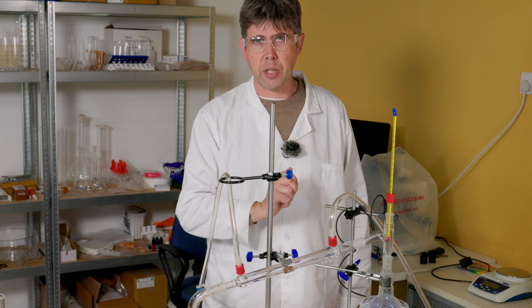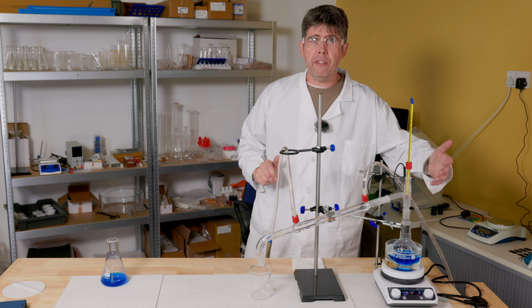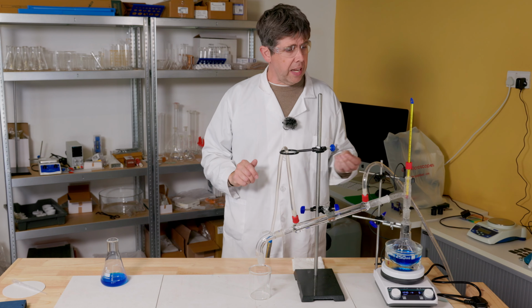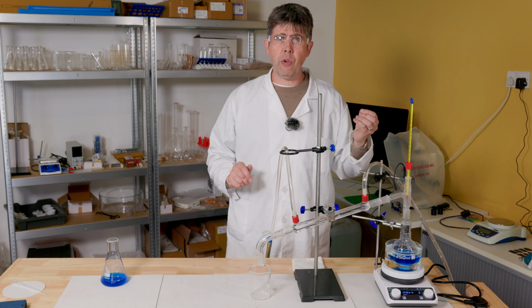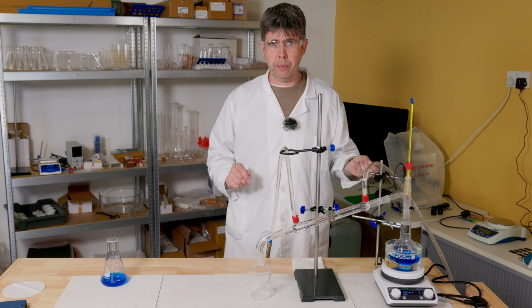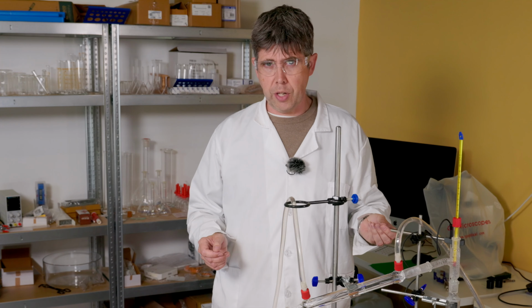chemical process. As we reach its boiling point, this space here fills with vapour. Our clue that this is happening is the condensation that's appeared and the fact that the temperature on the thermometer has now rapidly risen to the boiling point of that fraction, which in this case is 100 degrees C, and indicates to me that I am collecting water.